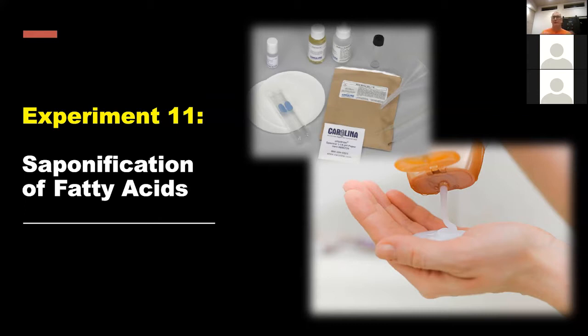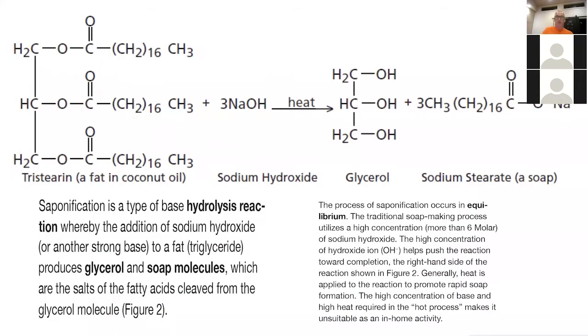We're going to release those fatty acids from the triglyceride and go from having a fat to having a fatty acid. And then, as Cassandra so helpfully pointed out, when we add a salt, then we'll be able to actually turn it into soap. So what are we talking about here? Oops, let me go back.